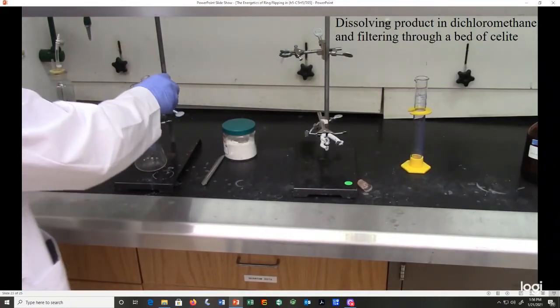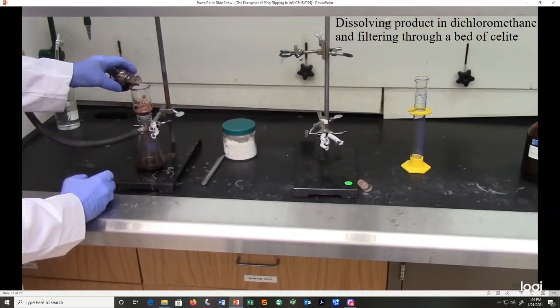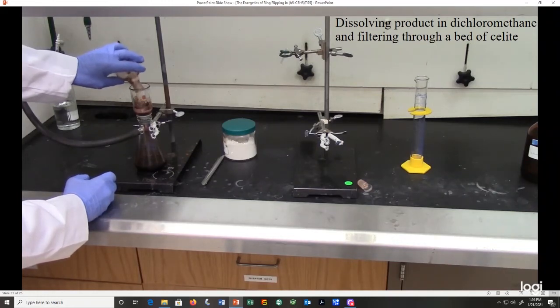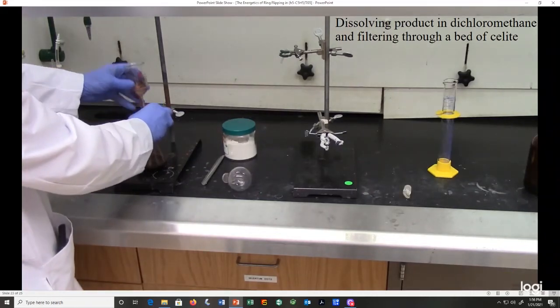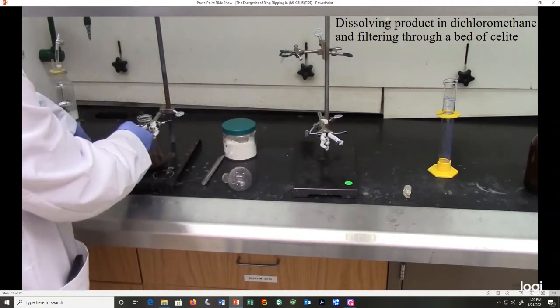And then we're just going to filter it through that bed of Celite. So at this point, we can transfer our filtered product back into our round bottom flask.